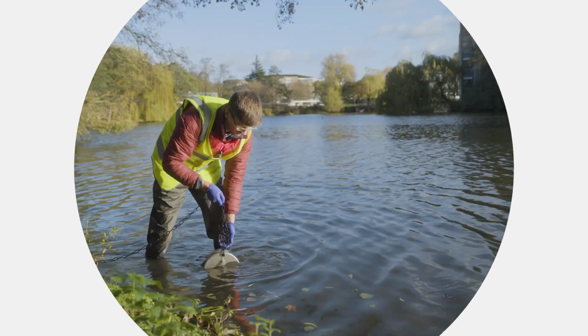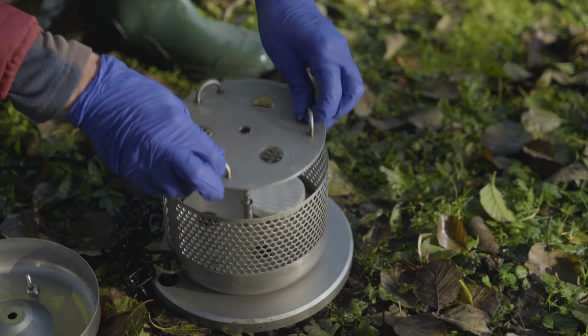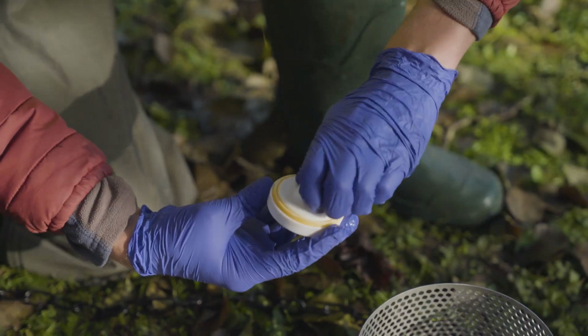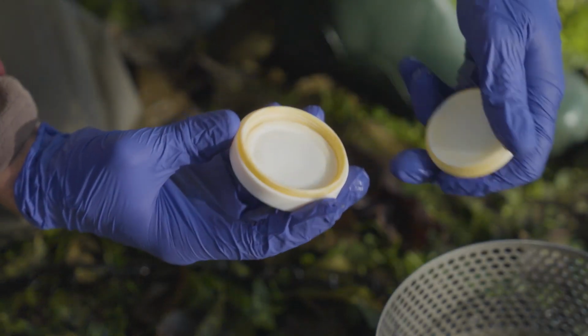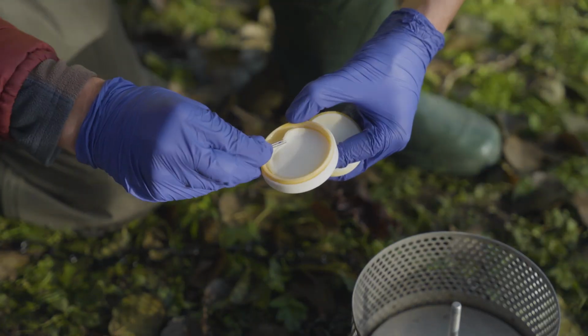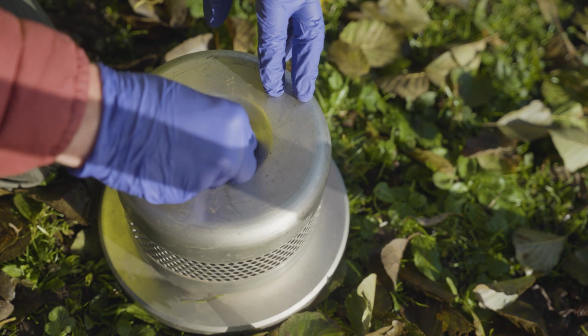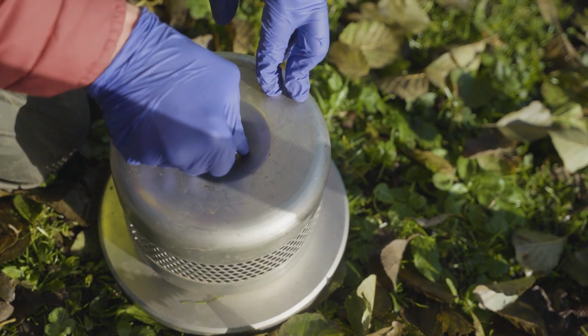Once the collection period is over, remove the sampler from the water carefully. Dismantle, remove the sample disc, then place it into labelled sampling containers. The benefits of this method are its ability to detect contamination events potentially missed by grab sampling, and no power source is required. However, the samplers may be disturbed or stolen, can be difficult to set up, and do not provide time-specific data.